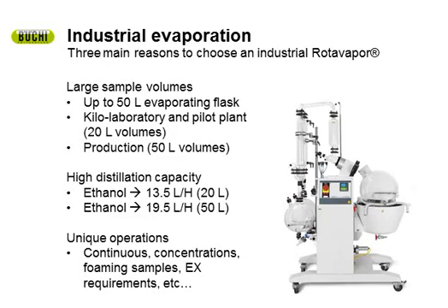And lastly, if you're working with some unique operation, let's say you want to perform a continuous evaporation process. You want to save money on labor and you don't want a user right there watching the instrument. You want to be able to hit start, go away. Well, the industrial evaporators actually have, not all of them, so make sure you do your homework, but some of them will have this continuous option where you can hit start and it'll actually perform the whole evaporation process until it's finished, and you don't have to be present.